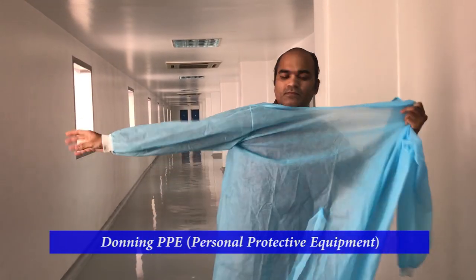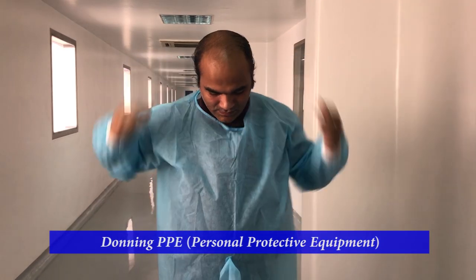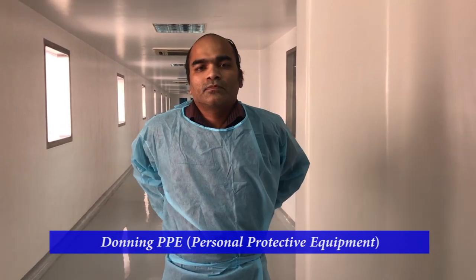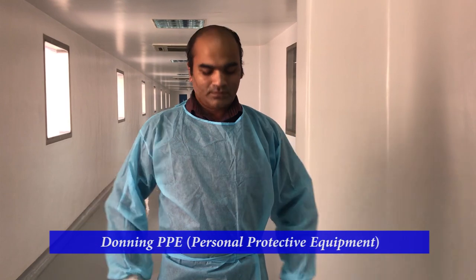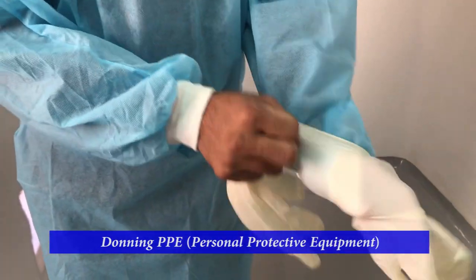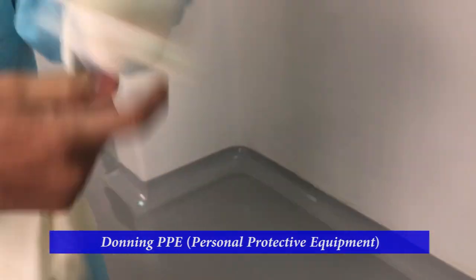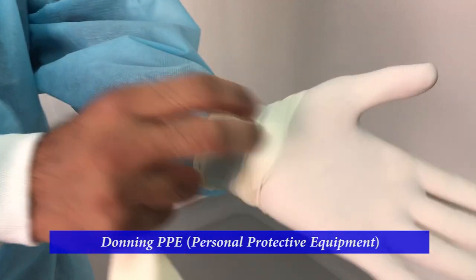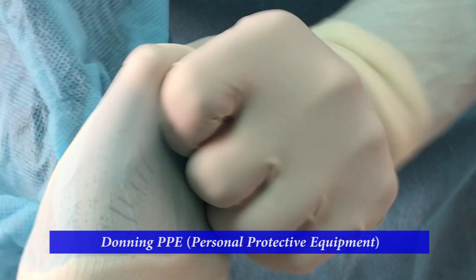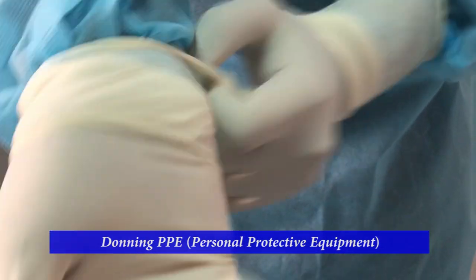Here we demonstrate donning of personal protective equipment for the separation of specimens. The PPE required are lab apron, double pair of gloves, head cap, N95 mask, shoe covers, and face shield or a pair of goggles. Please note the order of donning of PPE, which is performed in a designated clean area where all the PPE will be kept arranged.